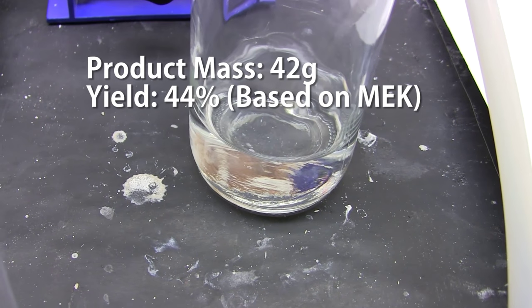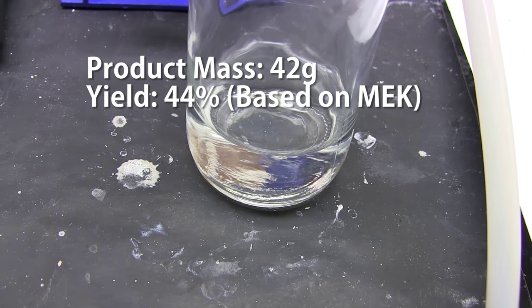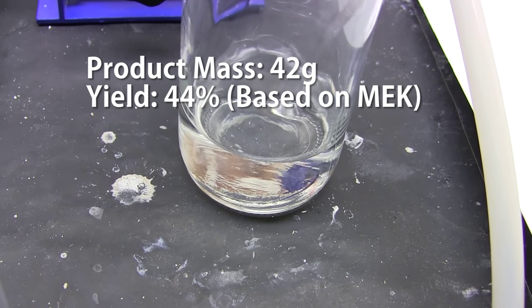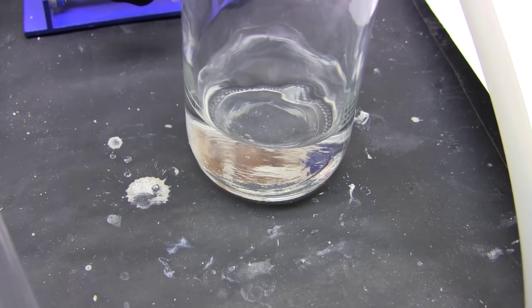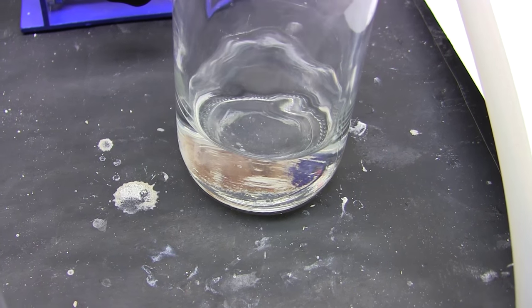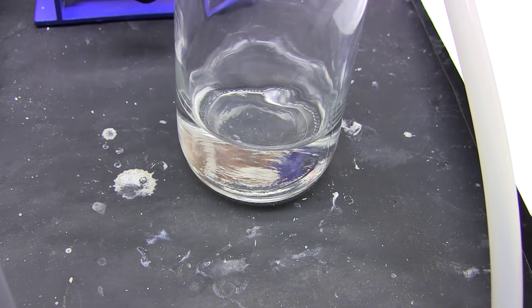My final purified yield was 42 grams or about 44% based on methyl ethyl ketone added. I think the poor yield was primarily due to the bad bleach I got. If you get a factory fresh bottle I think you'll do better.